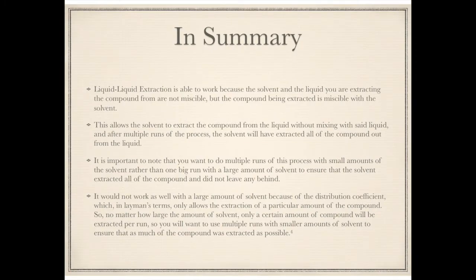So in summary, liquid-liquid extraction is able to work because the solvent and the liquid you are extracting the compound from are not miscible, but the compound being extracted is miscible with the solvent. This allows the solvent to extract the compound from the liquid without mixing with said liquid. And after multiple runs of the process, the solvent will have extracted all of the compound out from the liquid.